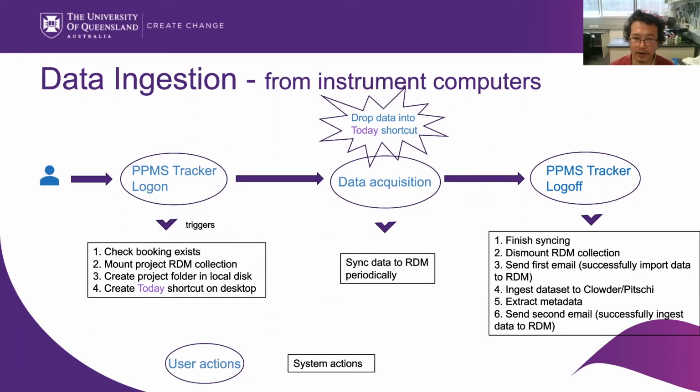The user will carry on their normal activities, controlling the instruments and capturing the data, and we only require the user to drop the data into that Today shortcut. What's happening in the instrument computer is that periodically there's a process happening in the background.